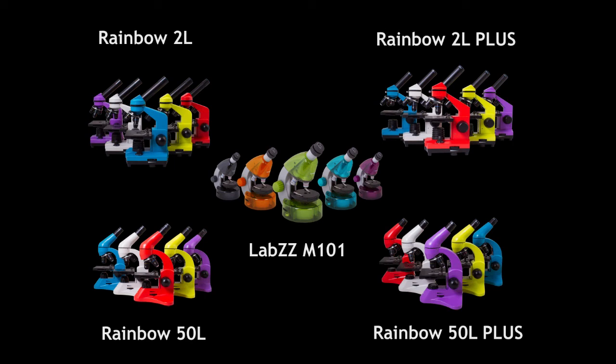We have described the features of each series of Levenhuk microscopes for kids and students, and we hope it helps you make your choice. The bright Levenhuk Rainbow and Levenhuk Labs biological microscopes mean perfect optics, reliable assembly, original design, and lifetime warranty.